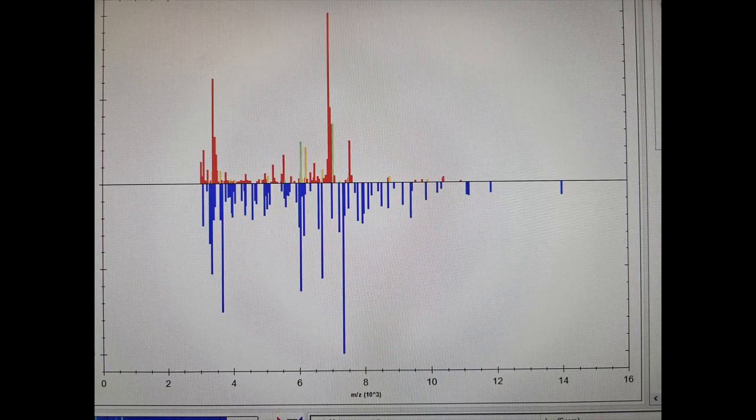So now that we know how to set up the MALDI and make all this magic happen, I'd like to talk more in depth about how the analyzer actually works. We're looking at a comparison graph that was shown earlier in the video. Each bar here represents an amount of ionic particles that struck the detector during testing. The larger the bar, the more particles of a certain mass hit the detector. So on the left is a generally large spike in lightweight particles. A few particles along the right get heavier and heavier, but as we move to the medium weight, we see a larger spike. And then to the right, the heavier particles seem to peter out, they're not so common.